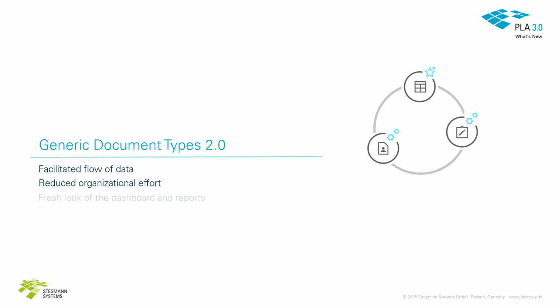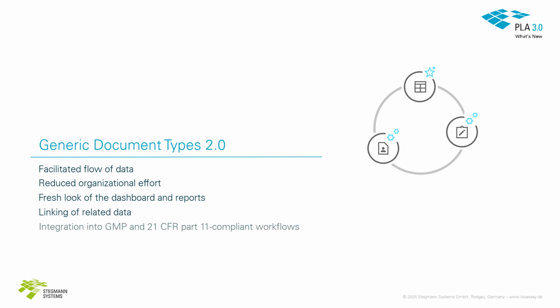Everything is presented in a fresh look on the dashboard, and in reports. And if you want to manage related data, you can even link documents of different types to each other. Of course, the add-on integrates seamlessly into GMP and 21 CFR Part 11 compliant workflows, leaving you with full control over who may provide, access, or modify the information.